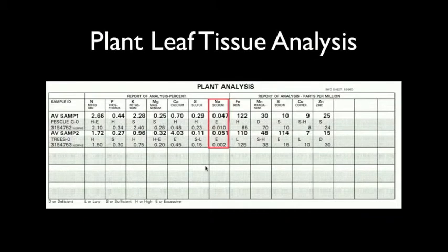When we look at this, this is one of the few things that it says it has an excess. There's only a couple of places where you have an excess on this whole report, and none of them is excessive in both the turf and the trees. None of these elements is excessive in both of them except this single element. Right. So where is this sodium coming from?